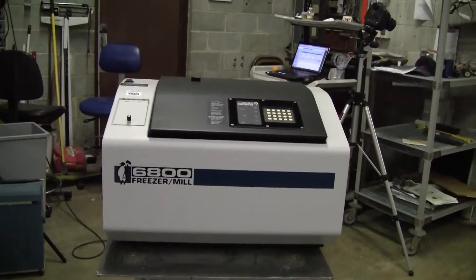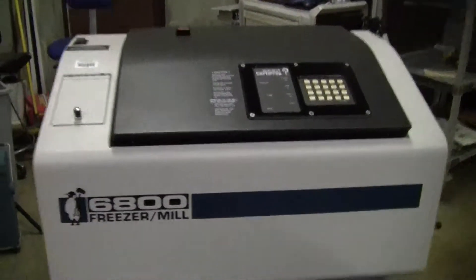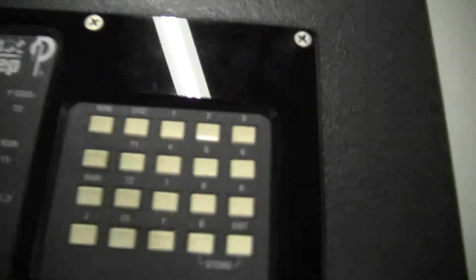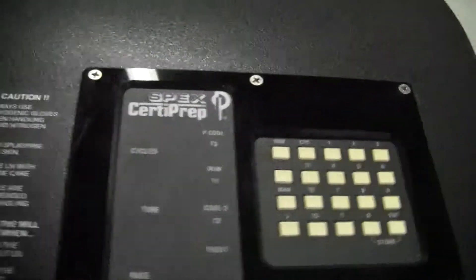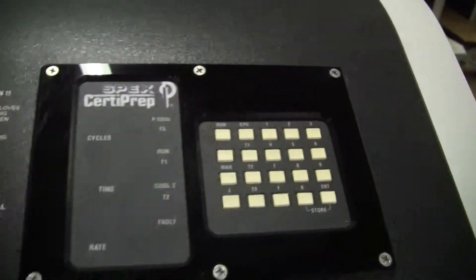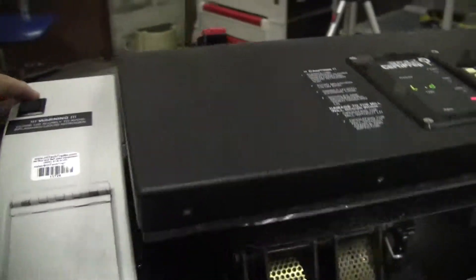Hi, this is Jim, Hi-Tech Trader. We're looking at the Spex 6800 freezer mill. It's got a digital display. It's got a switch for opening and closing the lid.